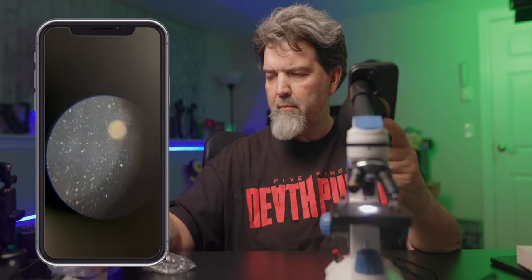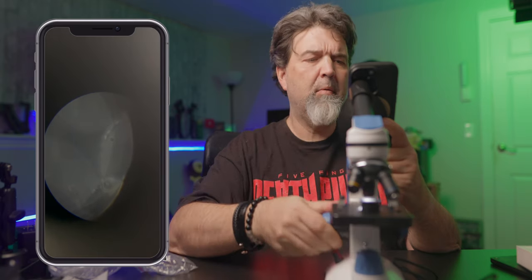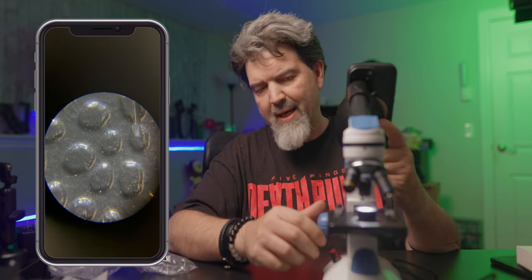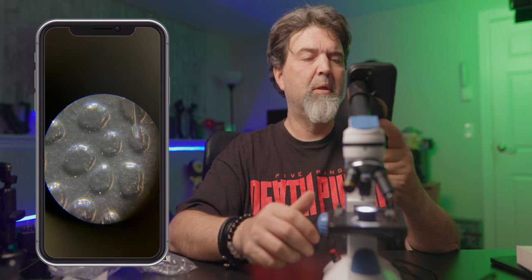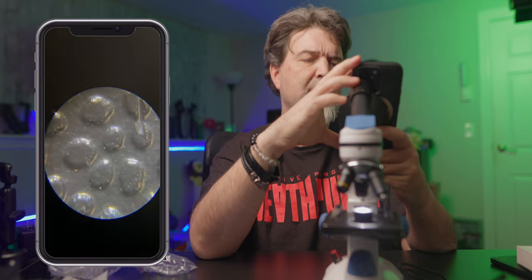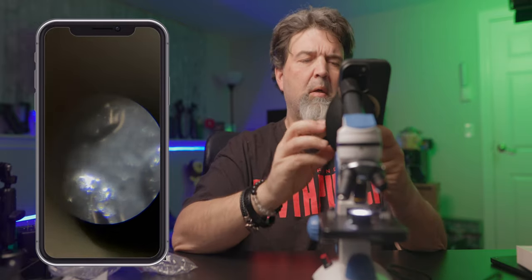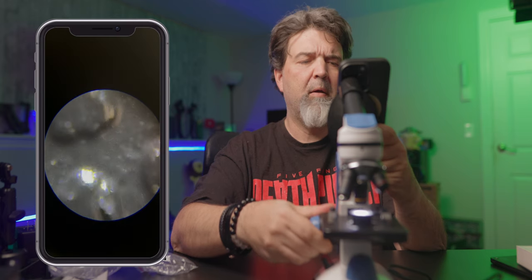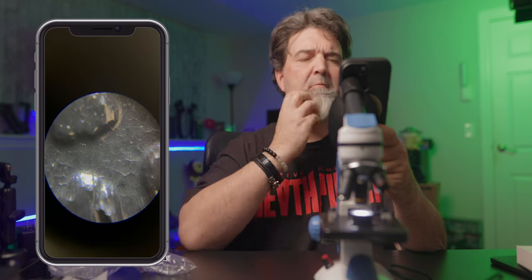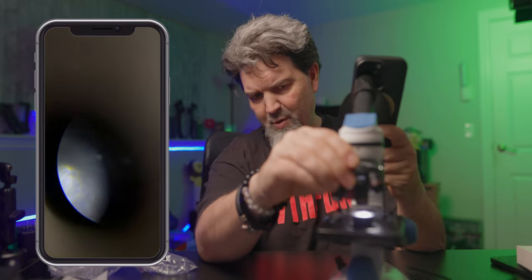I'm wondering if this thing right here has texture on it - can I fit that in there? I'm putting it in there, lowering you down. Look at that, that's actually pretty cool. That's probably at the least amount of zoom. Let's go bigger - snap you on. I just gotta kind of line you up, find the spot, and really fine-tune it. That's in super tight. Let's see if we can go one more, but I think it's too thick.